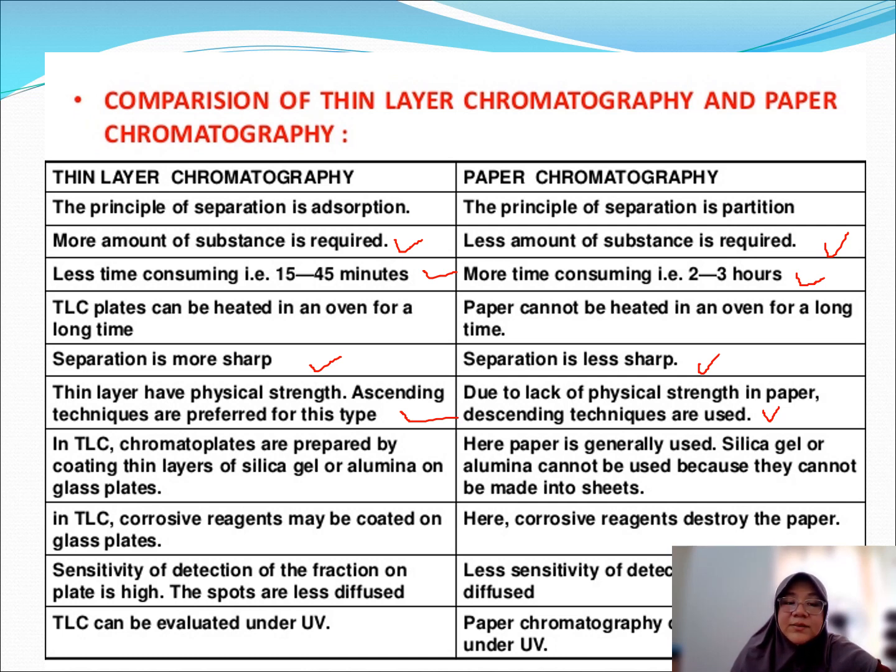For thin layer, the principle of separation is by adsorption. However, the principle of separation is by partition untuk paper chromatography. So you can read more on this comparison for TLC and also paper chromatography. So these are the two techniques that are highly focused in this chapter, week 9.